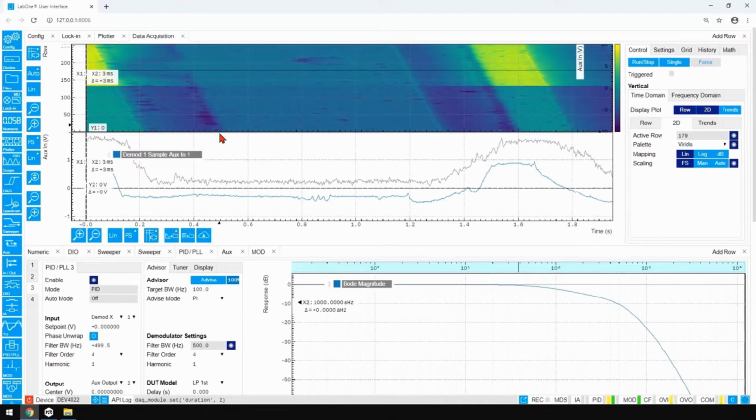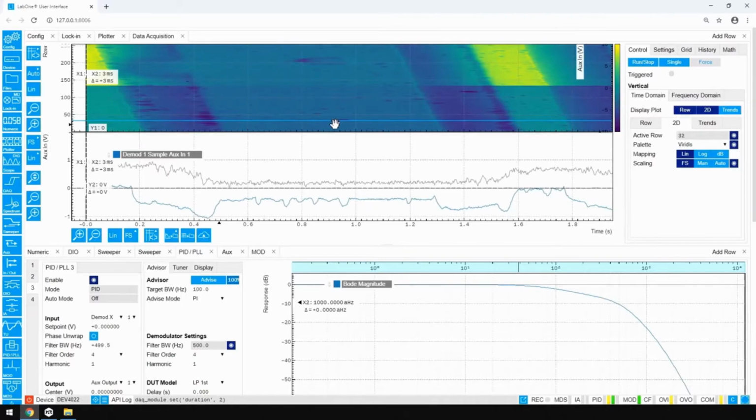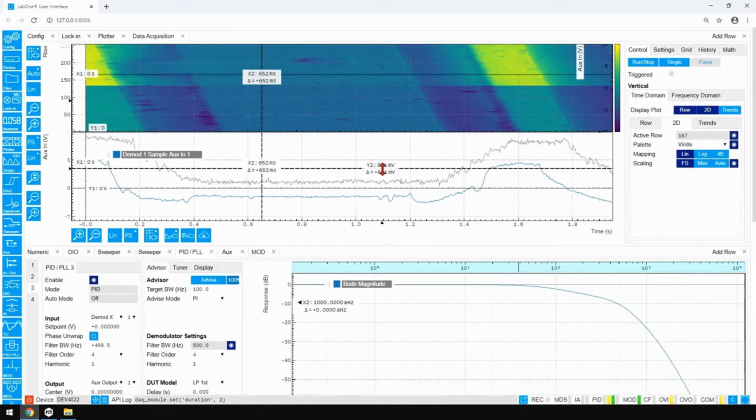So let's go to this full scale and make some comparison. First of all, we can compare the overall change when you apply 1 volt when we are in AM mode. So this would be the gold strip before we apply 1 volt and after. We now measure a difference of almost 900 millivolts.